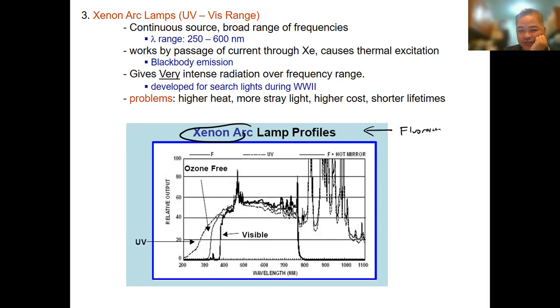So just like the first two, they're always what we call continuous sources. We don't see any line source, at least in UV-Vis. Okay. What do you think is the line source? What light source gives light in a particular line? A cathode tube. A cathode tube. But what else? Usually the laser comes in here. A laser has only what? A specific wavelength.